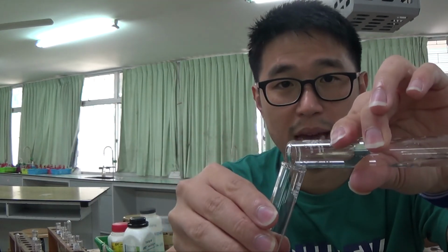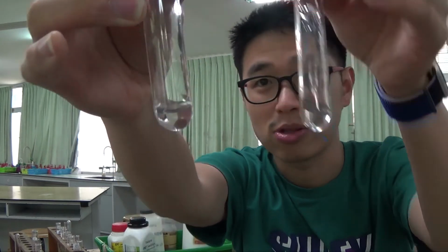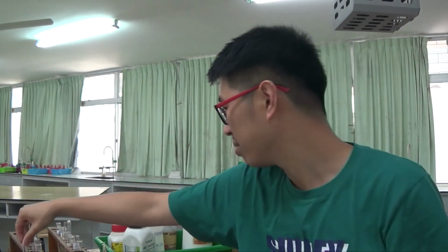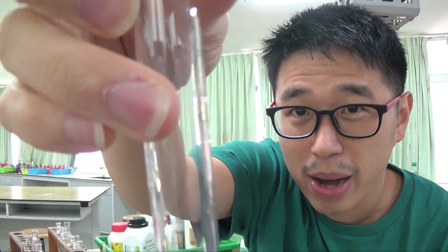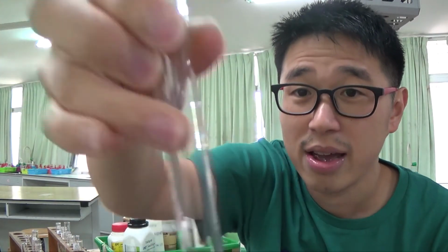So ideally speaking, I can test for chloride as well. Maybe I have enough, so I'll save one for NaOH. I do have another test tube. Oh no, this is dirty. I don't want to wash up too many test tubes afterwards. It's got a bit of browning on the upper part there. It's inside, but just be aware that this was already there when I did this reaction.